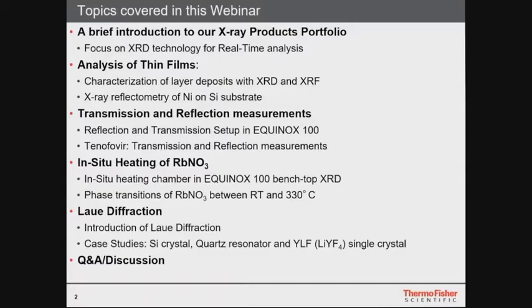Afterwards, I will show you some measurements in transmission and reflection mode. Then we have a heating experiment of rubidium nitrate. And last but not least, there will be a section about Laue diffraction. In this section, I will give you also a brief introduction into the technique.